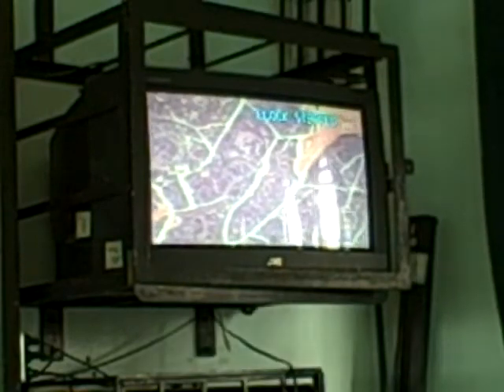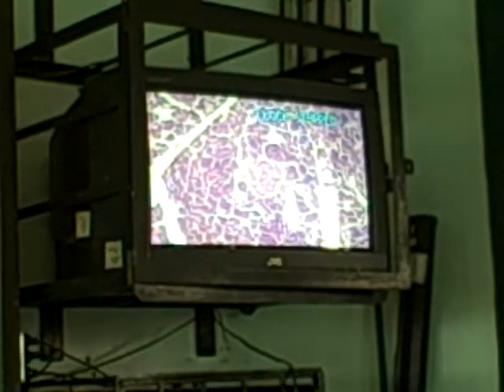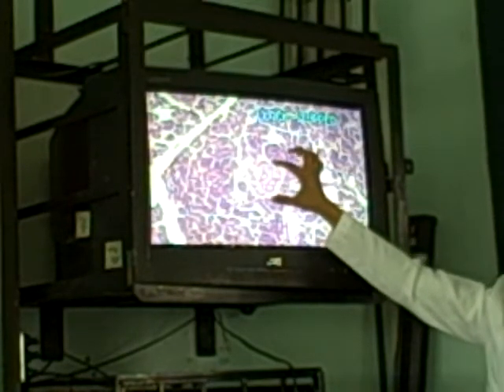By scanning, you try to identify portions of your pancreas where you can see the islet, to differentiate it from your parotid gland, because they are very similar. They are both serous. So you have to identify the islet of Langerhans. Commonly, that's your islet, small islands discovered by Langerhans. It's the endocrine portion. So this is your islet of Langerhans.